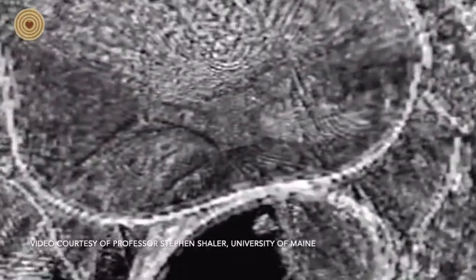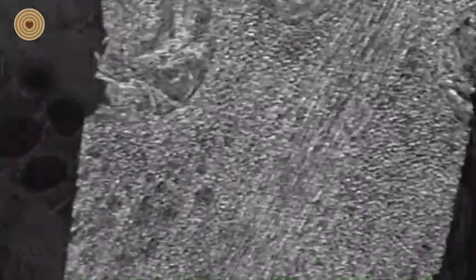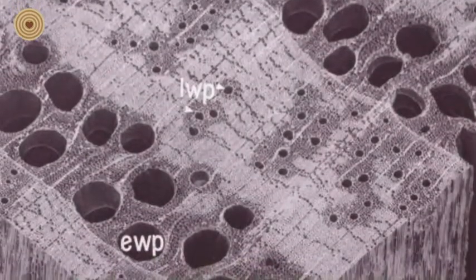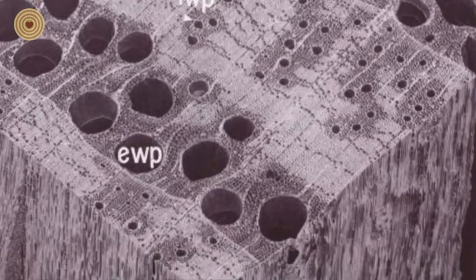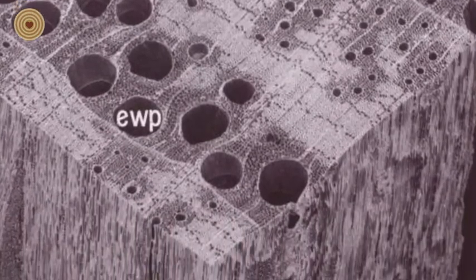This short x-ray microtomography video provides us a three-dimensional view through a sample of oak, and we get a good look at tyloses in the vessels as we digitally fly through the wood. Tyloses are very important in some types of wood products, and, for example, the oak wood for aging wine and whiskey must be selected carefully, as oak species without tyloses, such as this sample we viewed earlier, would allow all the liquid inside a cask to leak out through the open vessels.